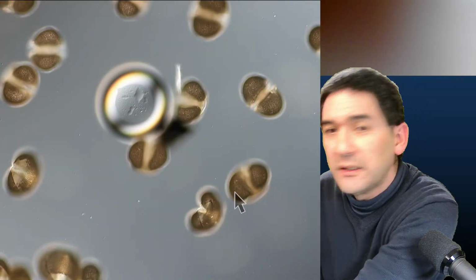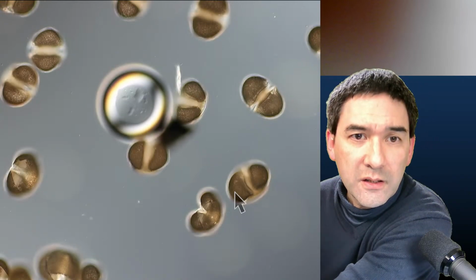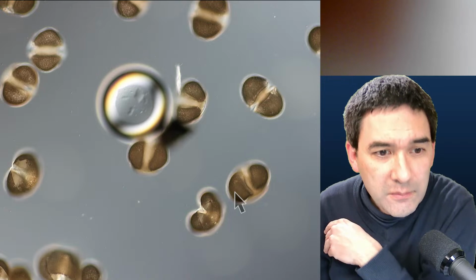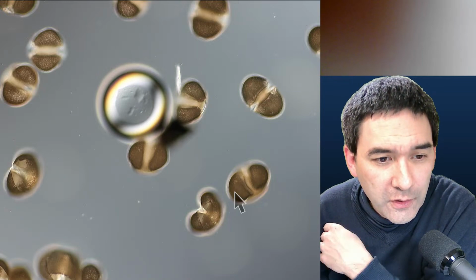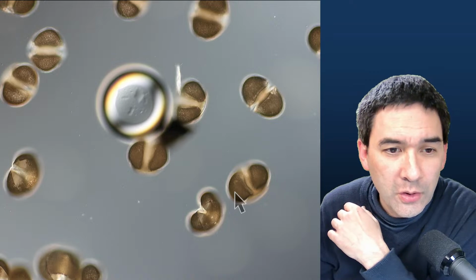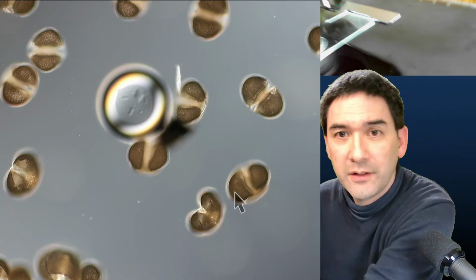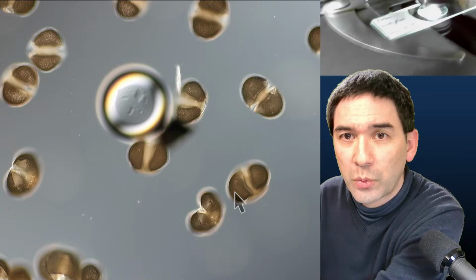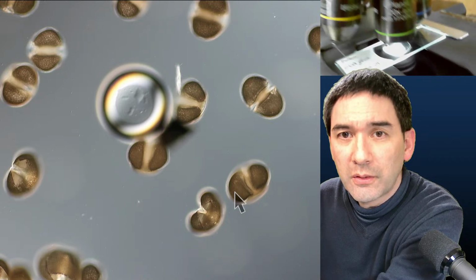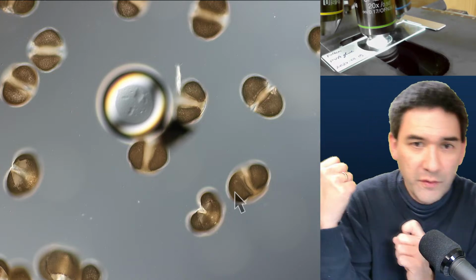Okay. And the top camera stopped working. Isn't this nice? Somehow it always does that. Let me quickly do the following. Stage cam, deactivate it. Now it should be gone. I reactivate it, and I hope that it returns. And here we are. Sometimes, for whatever reason, it stops working, but here we are. So that is now the pollen slide, the one that you see, other side over there.